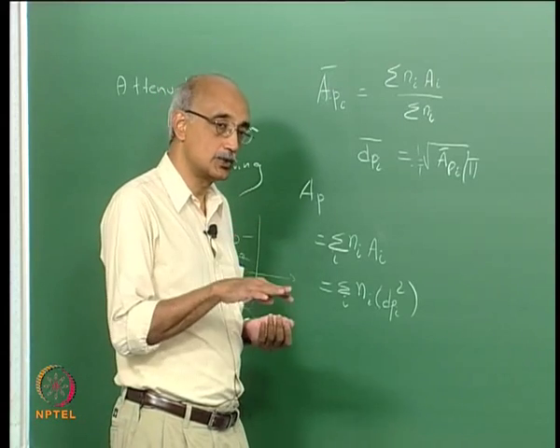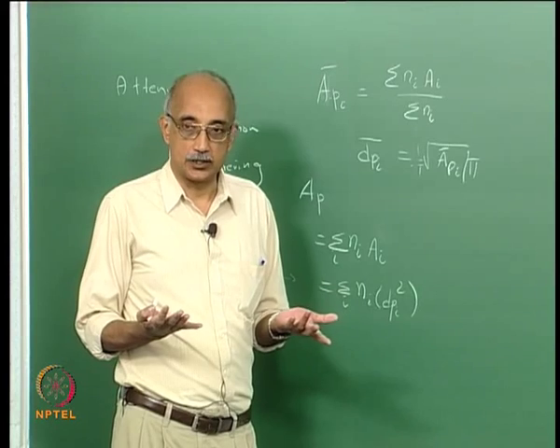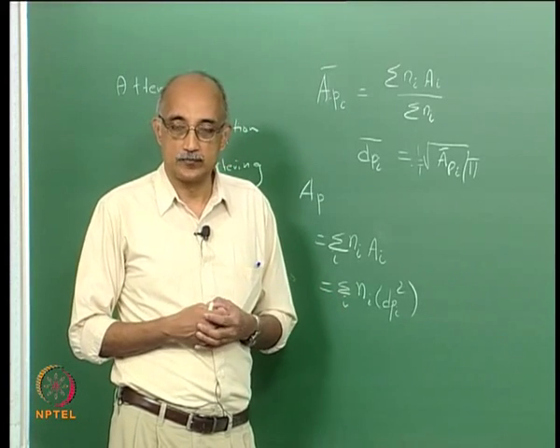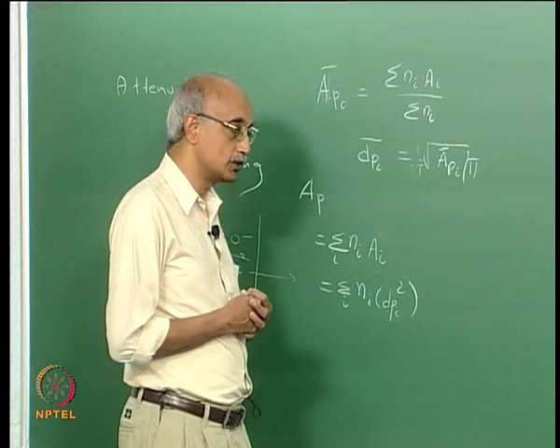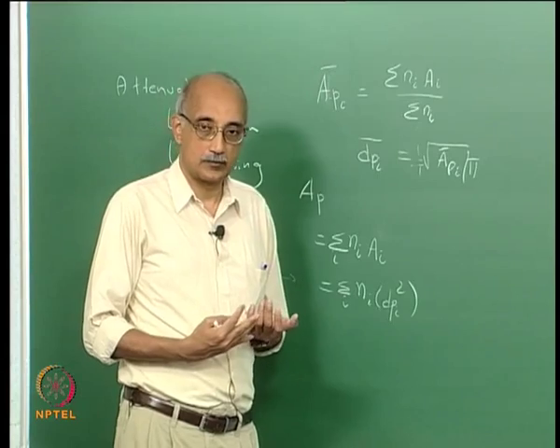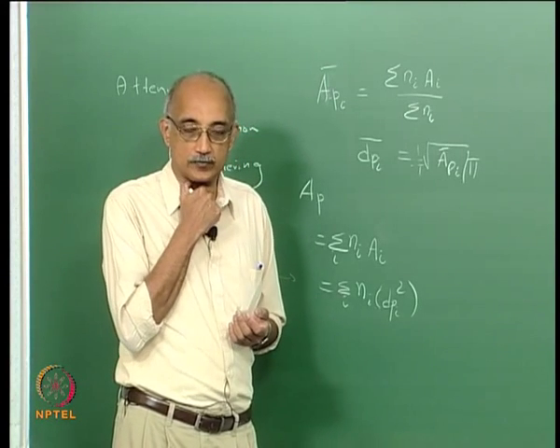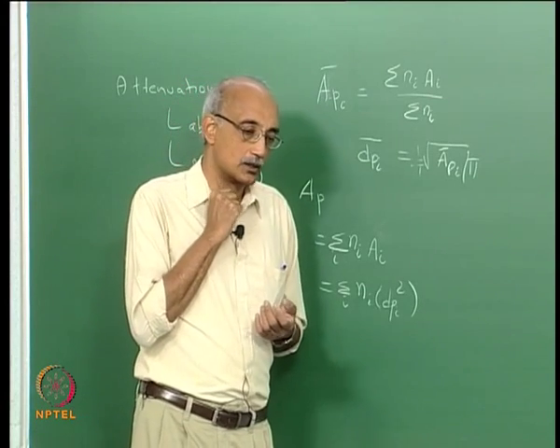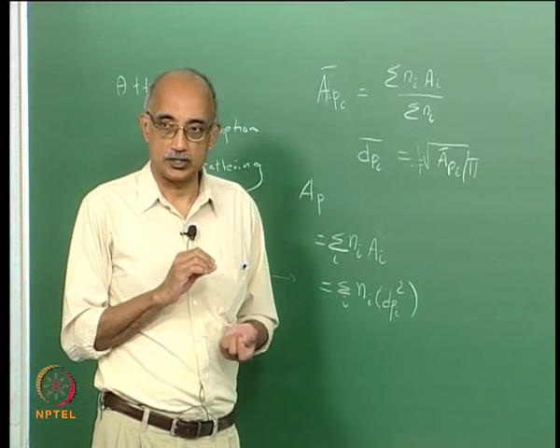Now as you go down to sub-micron sizes, if you want a particle size analyzer that can measure down to let us say 50 nanometers, that cost is closer to 25 lakhs, and if you want to go down to sub nanometer levels, then the price just exponentially increases. And so you have to be again watchful about the technique that you use for your size characterization measurement.